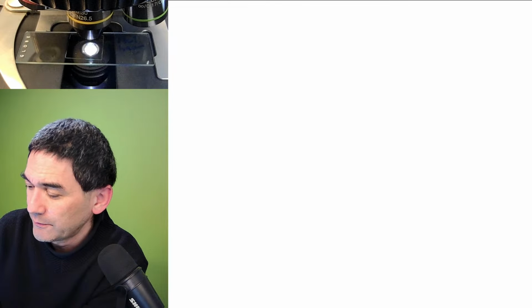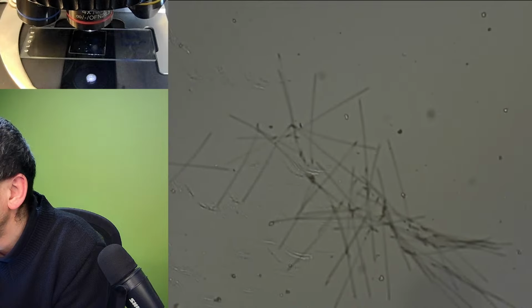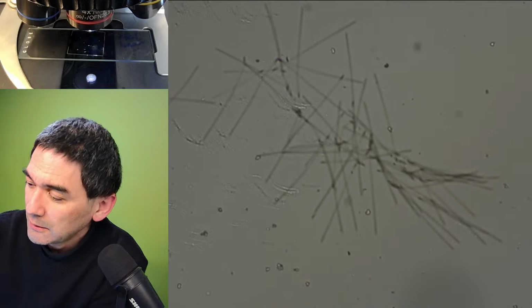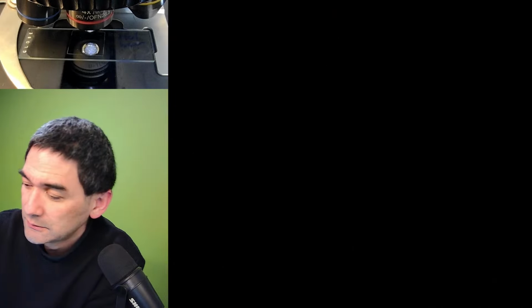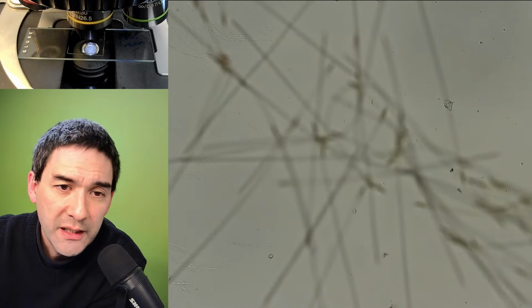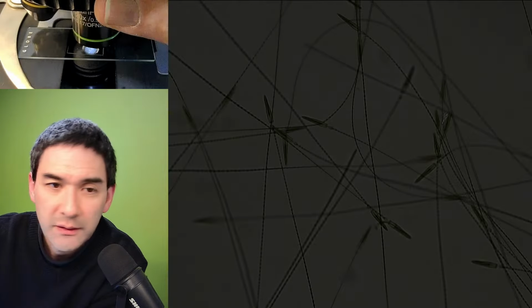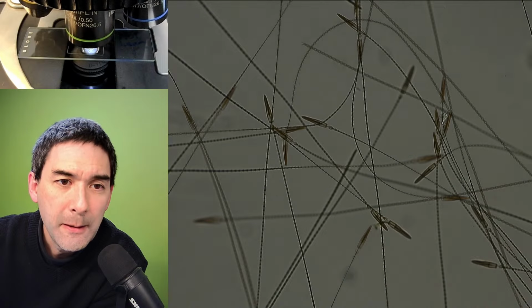I need to find them now. Just a second. You always start at a low magnification. Here they are. Again, they look a little bit like fibers as well, but these are those tiny so-called setae.